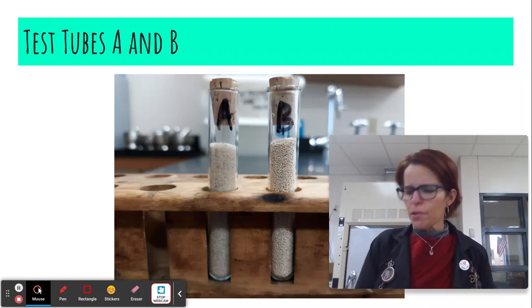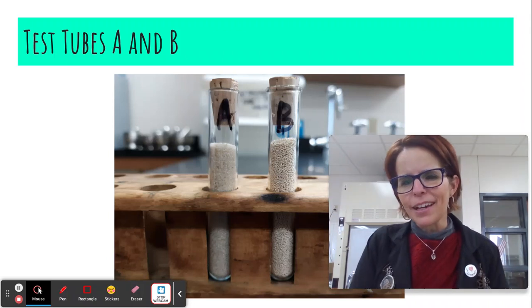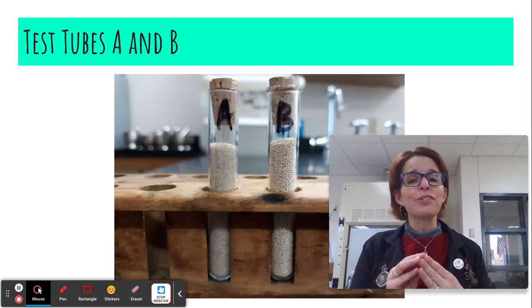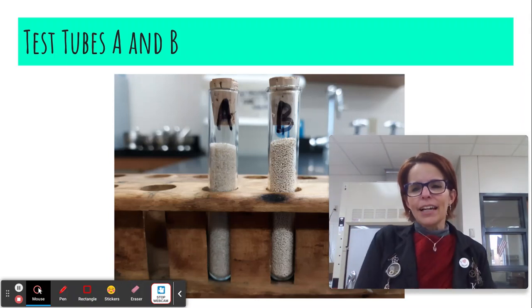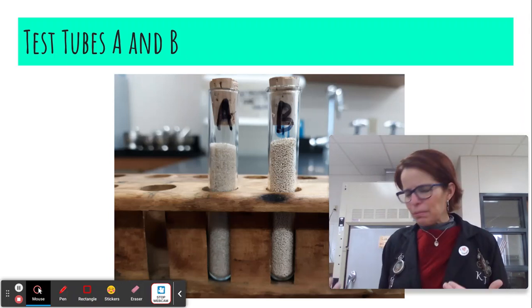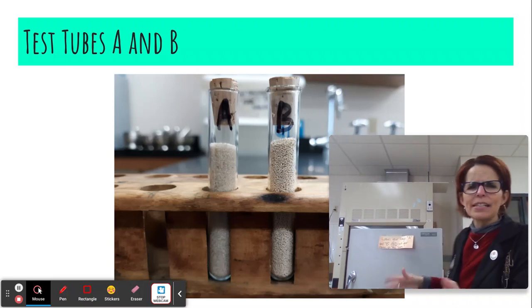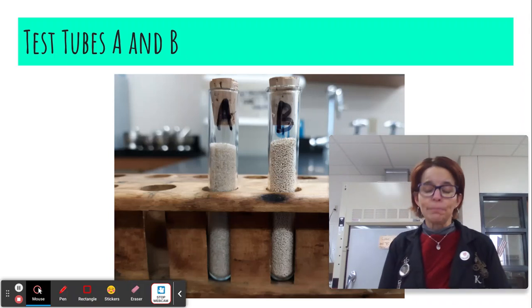But there are some other things that all living things do. And so we're going to do one of those experiments as well. So something that other living things do, they grow, they reproduce, and they use energy. And so we're going to use that all in one lab here. So I'm going to rush you through 3 labs. It won't take very long. But let's start with the growing one because it takes some time. We're going to use this machine back here. It's called an incubator. It's basically like a warm refrigerator, and it's where these guys can grow.